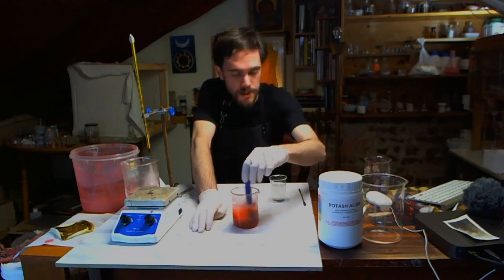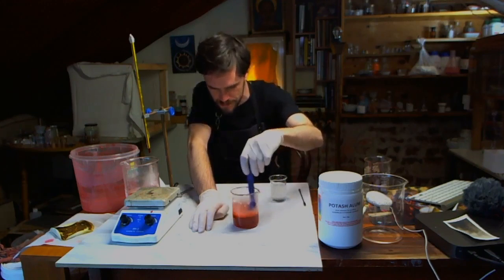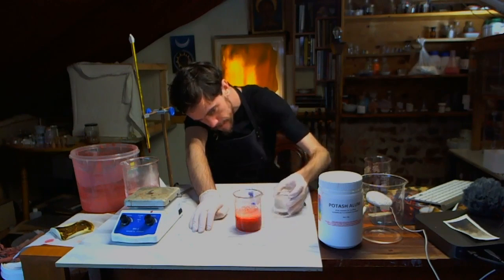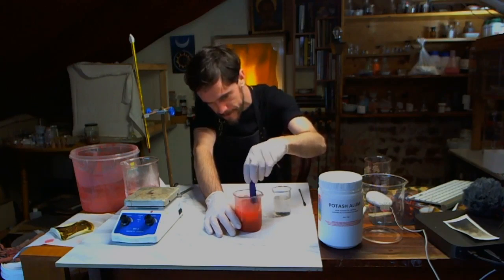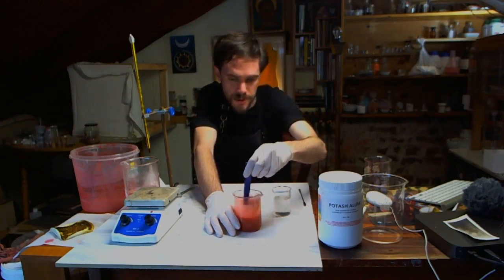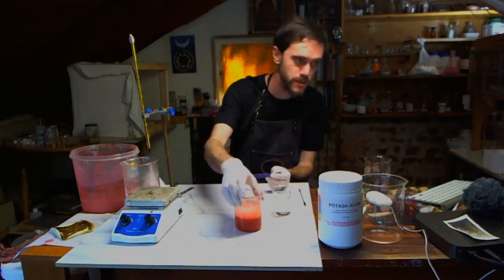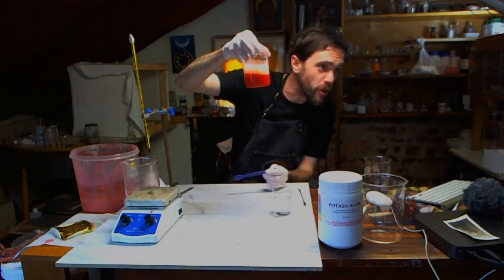Let's move forwards. Well. Maybe I spoke too soon. No, it's frothing just the same as it always does. We're getting a precipitate forming.